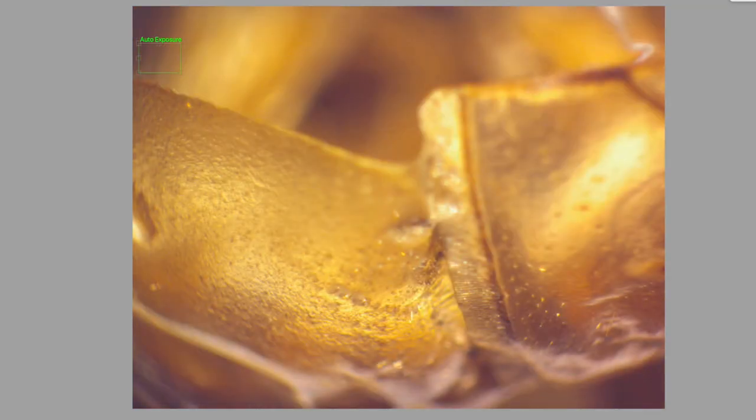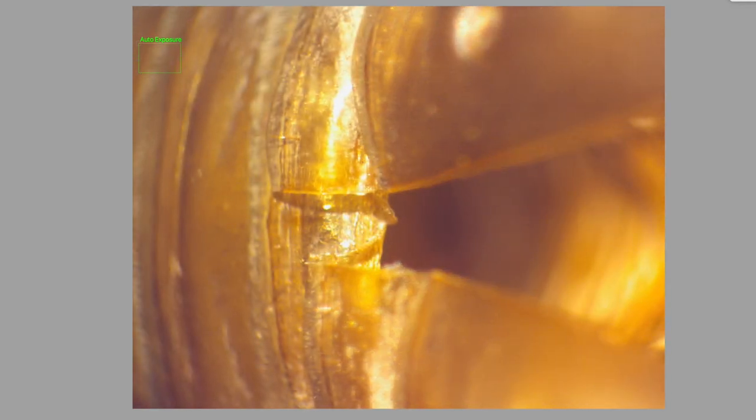I really want to put this in the SEM because I'd like to see what that fracture surface looks like. I assume that it's going to be a fast fracture, like a brittle material. But maybe there's some fatigue. I don't know. I'm curious to find out.